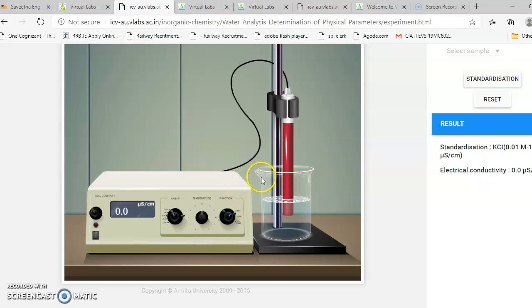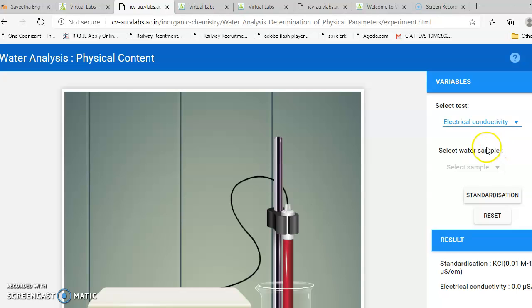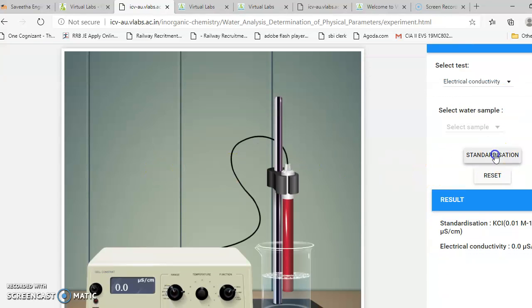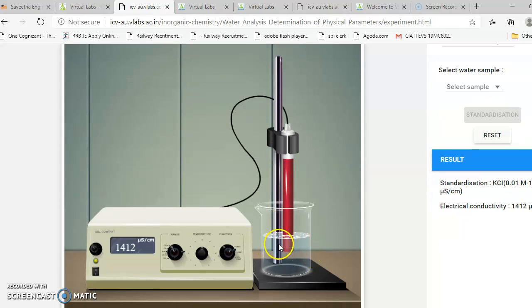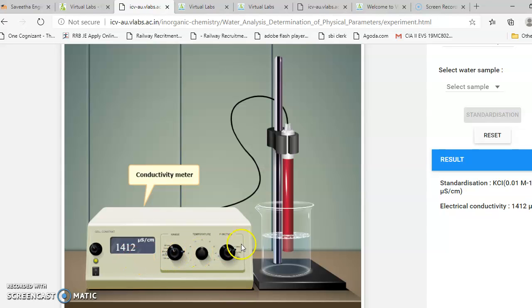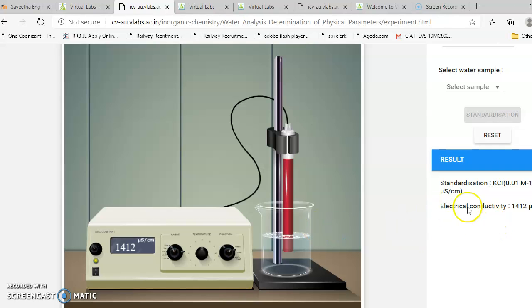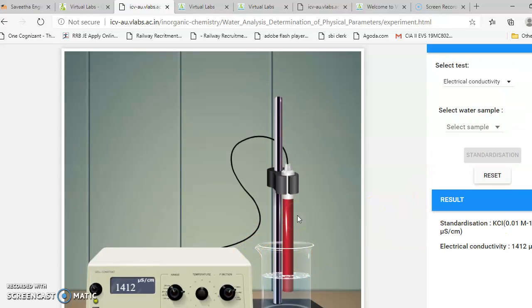First of all, you choose the conductivity measurement, then we can standardize. Standardization is done using standard KCl solution — 0.01 molar — where the electrical conductivity will be 1412 micro siemens. Once standardization is ready, we can get into the measurement and take the sample.